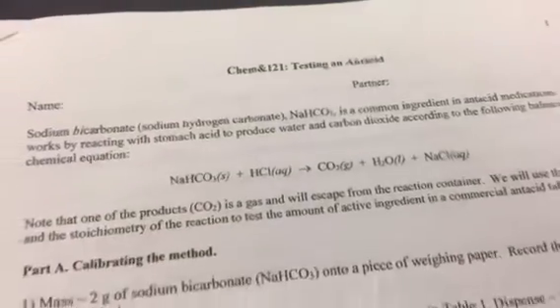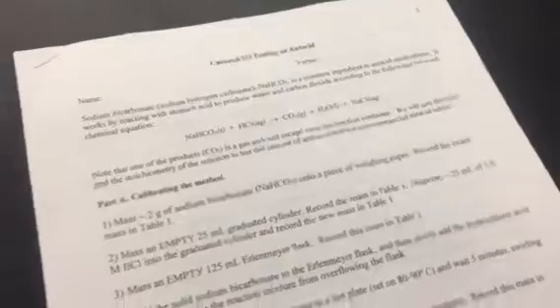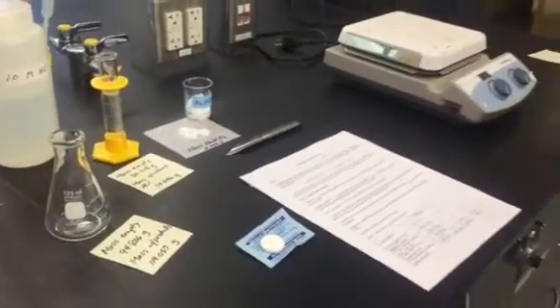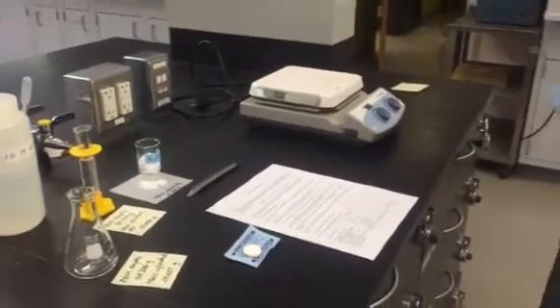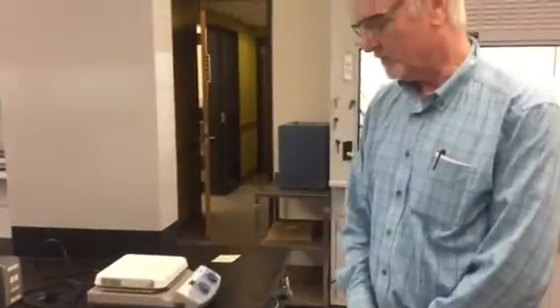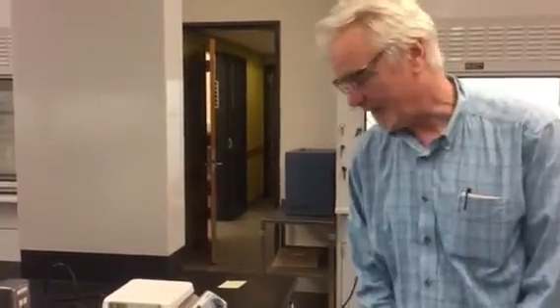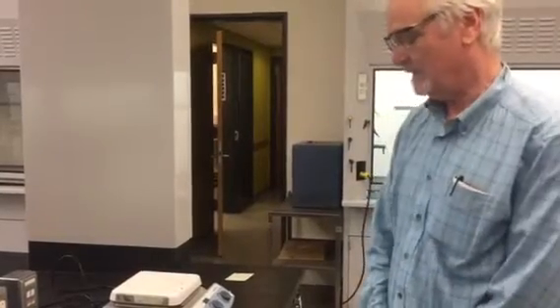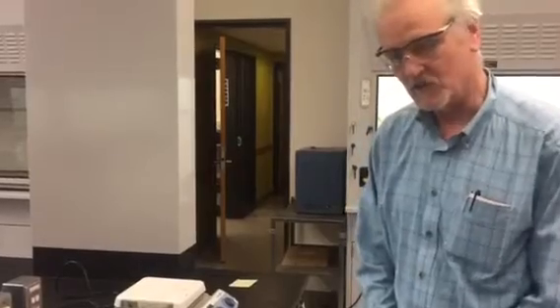Lab 5 is called Testing an Antacid, and it is a lab that's going to explore stoichiometry, the quantitative study of chemical reactions. And we're going to use a fairly common reaction where we're going to react sodium bicarbonate with an acid to produce a double replacement, and one of the compounds that's made decomposes rapidly into carbon dioxide and water. And we're going to use that decomposition in order to try and evaluate how well the reaction worked.